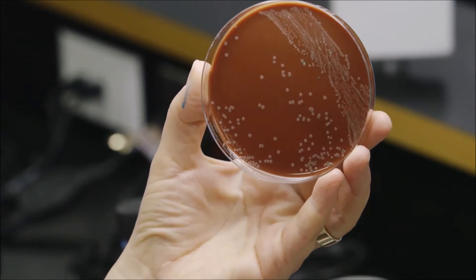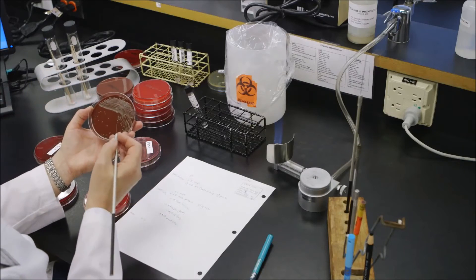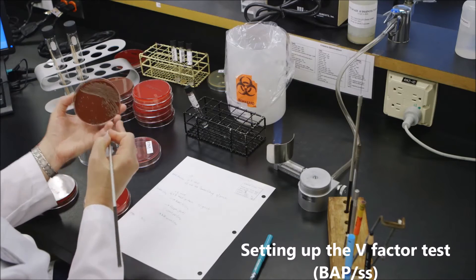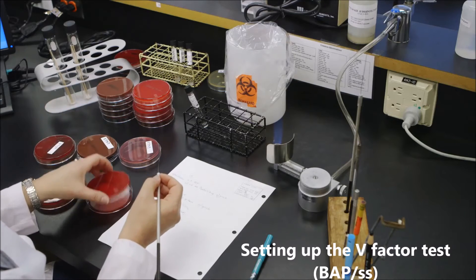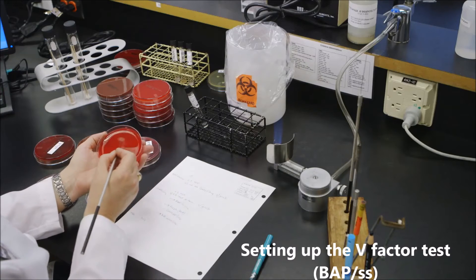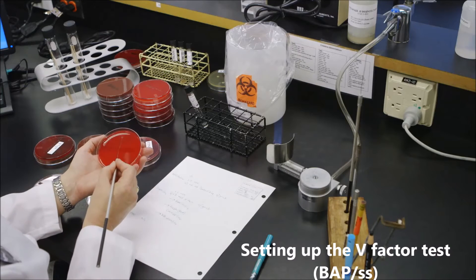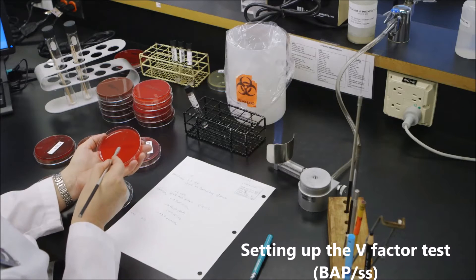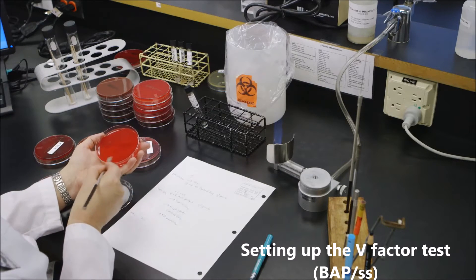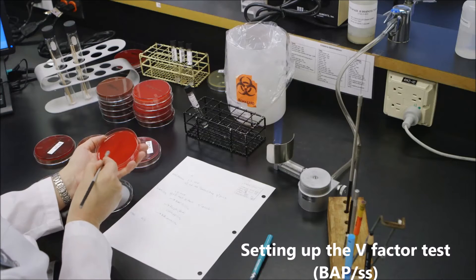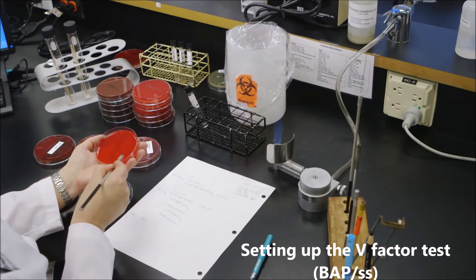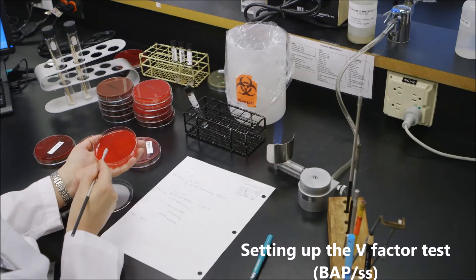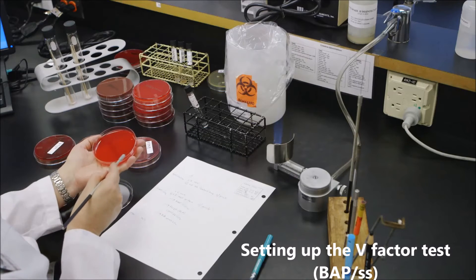And I start with touching the colony that I will have circled, just barely touching it, delivering it to the plate, and then streaking in four directions for isolation. It's important not to over-inoculate this plate, so I'm going to flip my loop to do quadrants three and four.